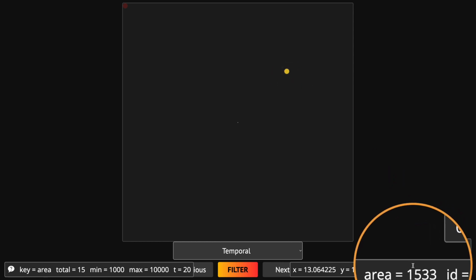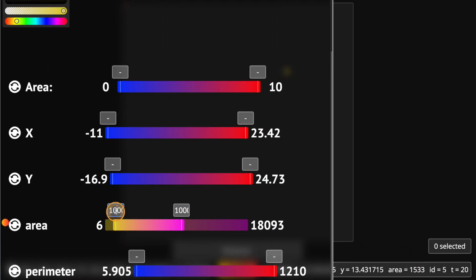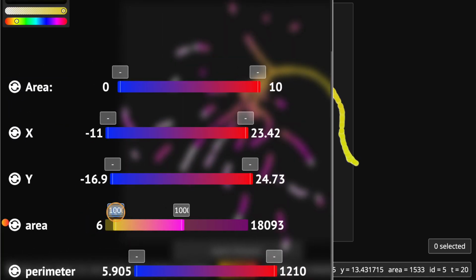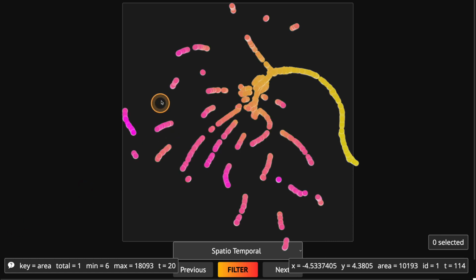So we've already gotten rid of a bunch of the cells, because their area is below the threshold. And if we were to update this back to its original values, now you can see all the cells are the right color. They're no longer white.